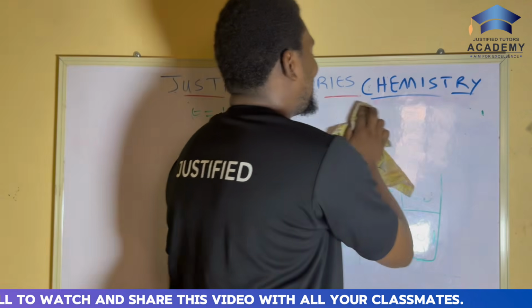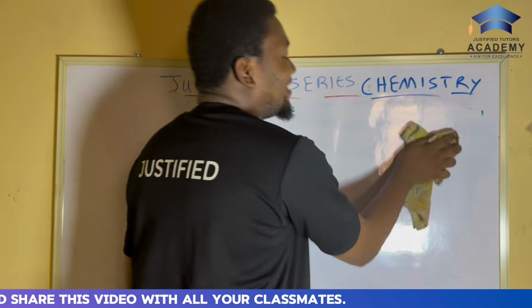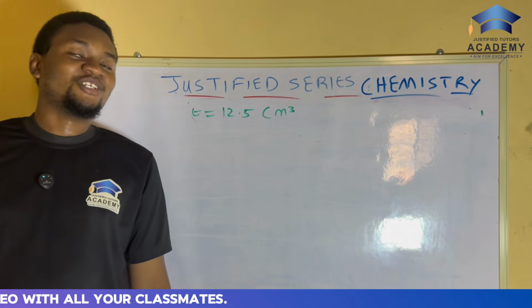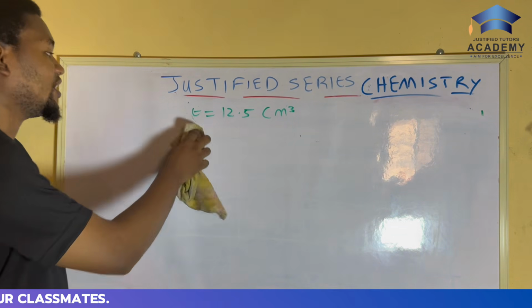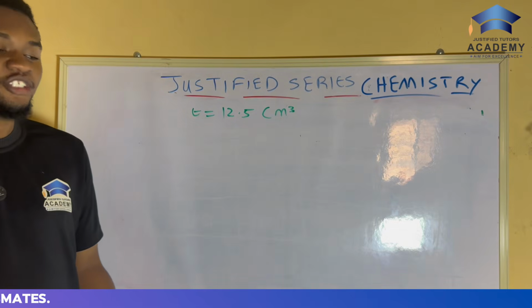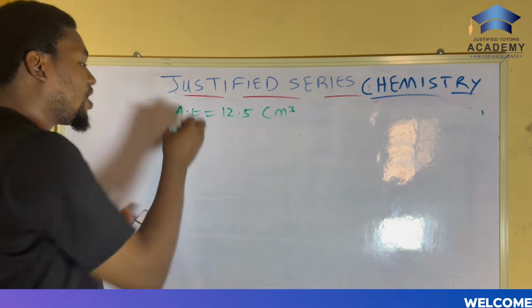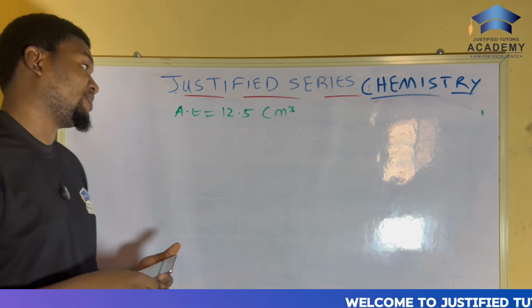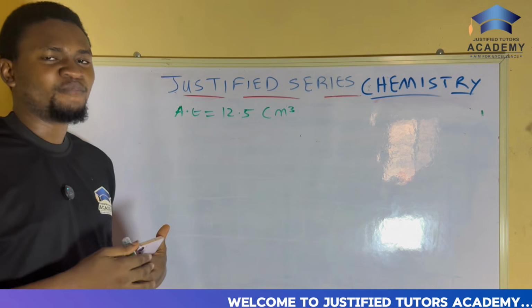So if your teacher is as nice as my own, or, how would I put it, just like my former chemistry teacher, then you are lucky. Because all you need is just the average titer value, and then you are good to go. Are you with me? Now let's begin the proper main work that your teacher will not teach you.